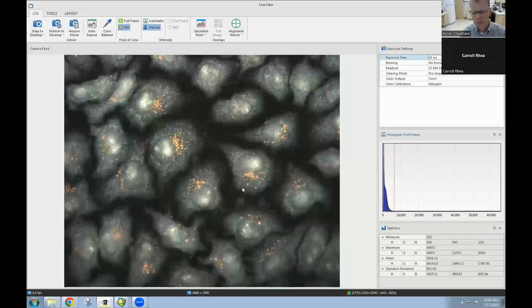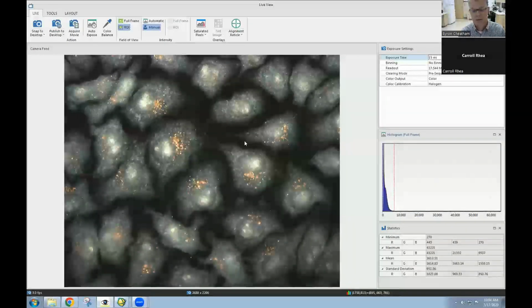If I want to observe nanoparticles, the last thing in the world that I want to do is to try to add clunky fluorescent labels to it that will potentially affect the chemistry of the nanoparticle. But even more importantly, if that fluorescent label in the context of the sample were to disassociate from the sample, I would just be looking with a fluorescent microscope at fluorescence that's disassociated from the nanoparticle. So it's really not a good way to try to look at nanoparticles, fluorescent labeling.